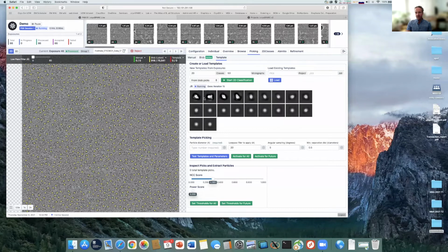Okay, so you can see as we're going here, that these templates are now beginning to actually get a few features on here. So aldolase kind of looks like an X. So, well, we'll see what it looks like in a few minutes actually. But what we're looking at here is there's 1, 2, 3 sort of sticky out bits of the X, and the fourth one is hidden behind.